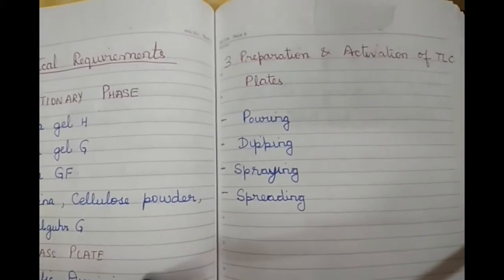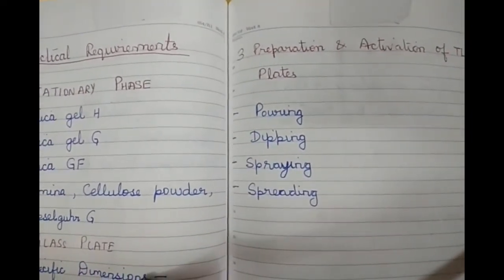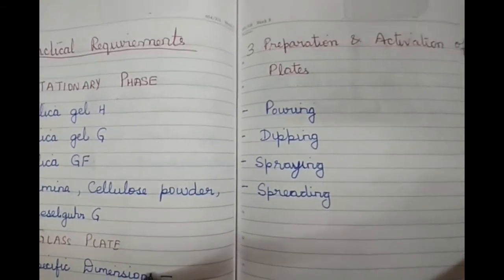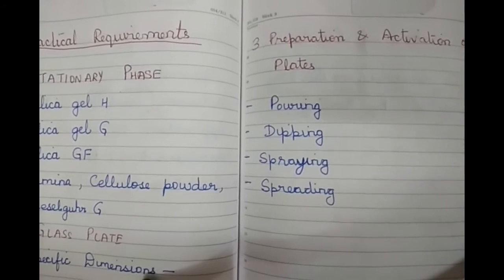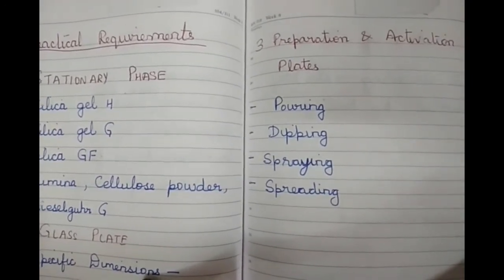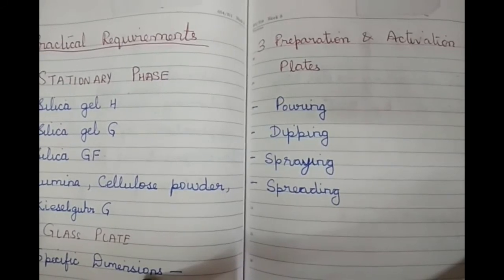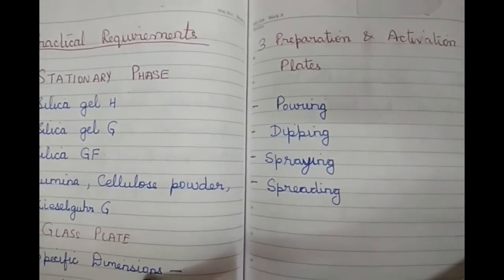Then preparation and activation of TLC plates involve pouring, which is the simplest method, dipping used for small plates, spraying, difficult to get uniform layers, and spreading, which is the best technique.